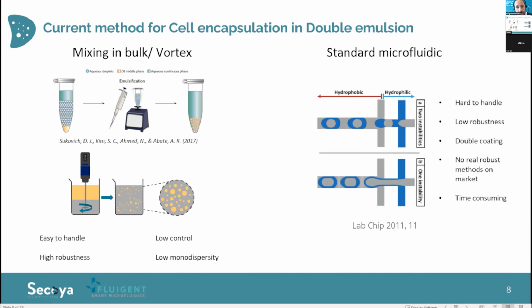The other method that could appear to solve the previous limitation is using standard microfluidic chips. Here you have a specific design with two identical designs, but coated differently.